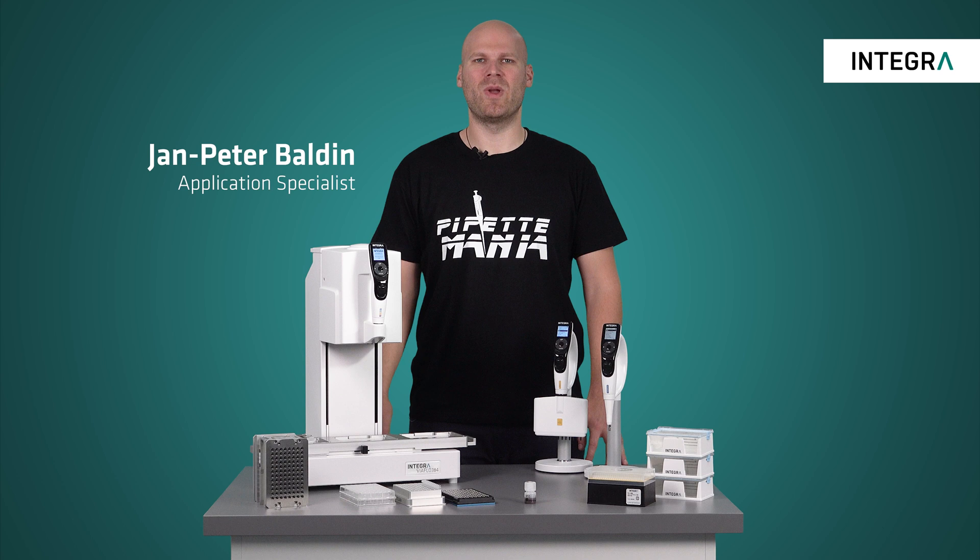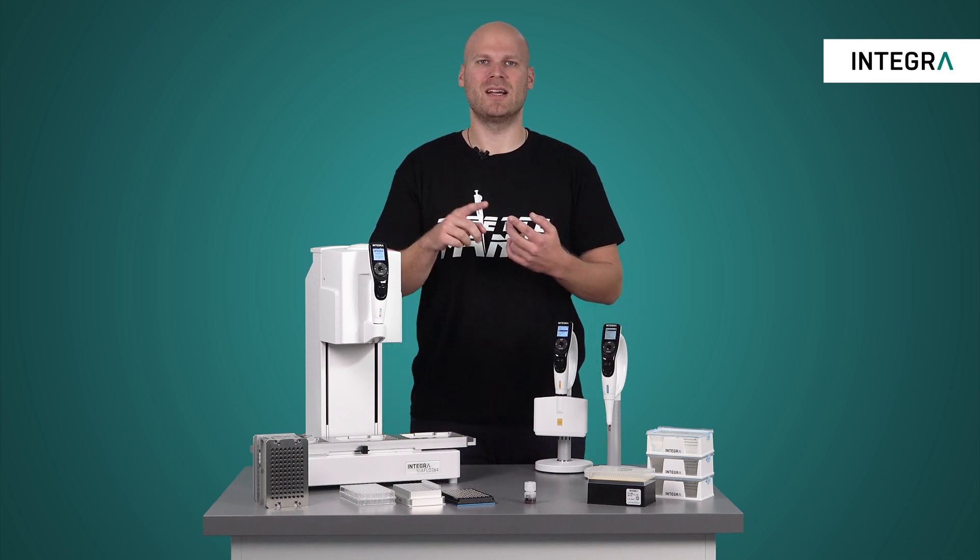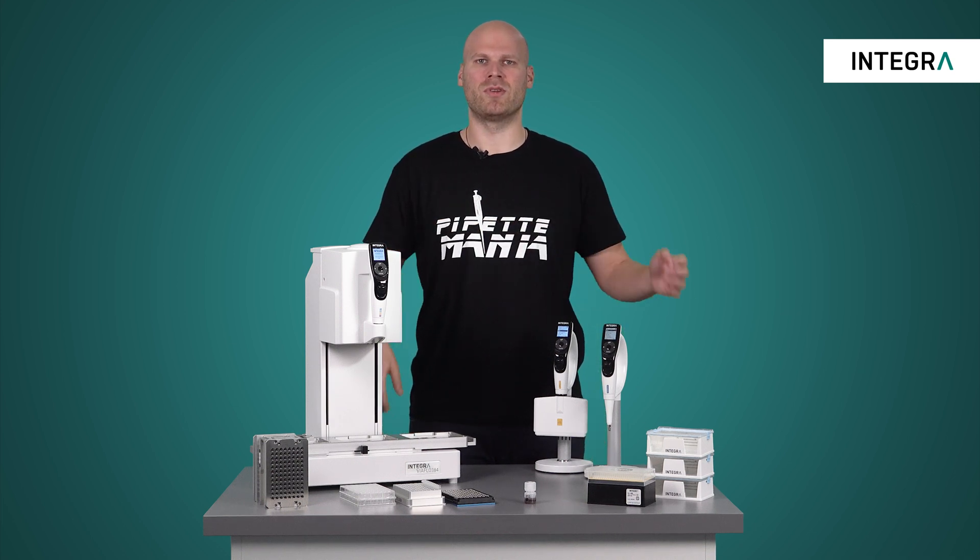Hi everyone! In this video we are going to show you how the VIAFLOW 96/384 electronic pipette can make DNA purification with magnetic beads faster, less error-prone and more reproducible.